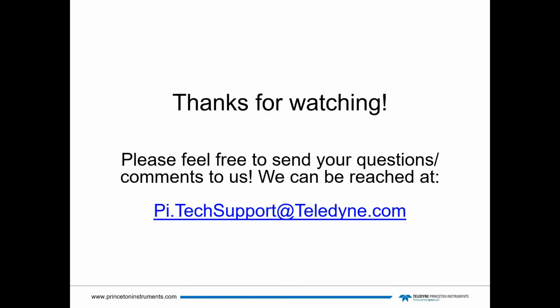Thanks for attending this seminar and going through this video. I hope you found the content useful. You could see that even in something seemingly simple like iterating through different exposure times and spectrometer positions, some important concepts come up about thread locking and handling events.